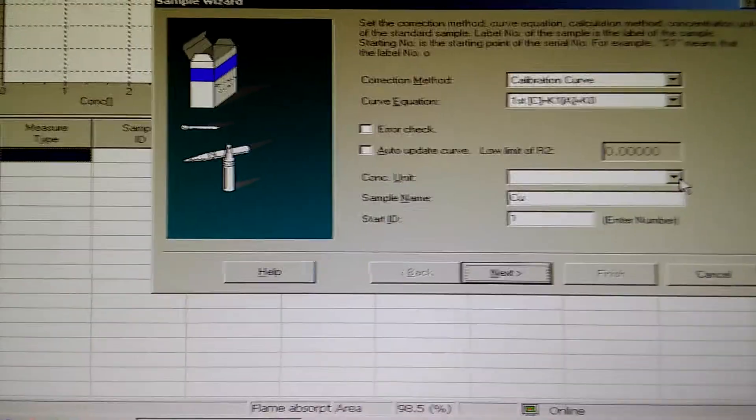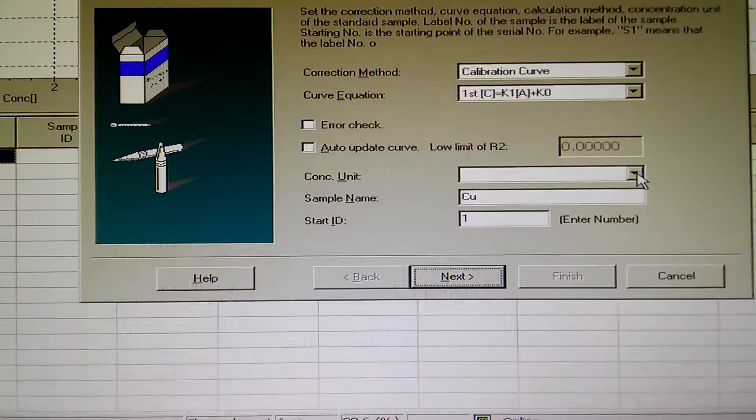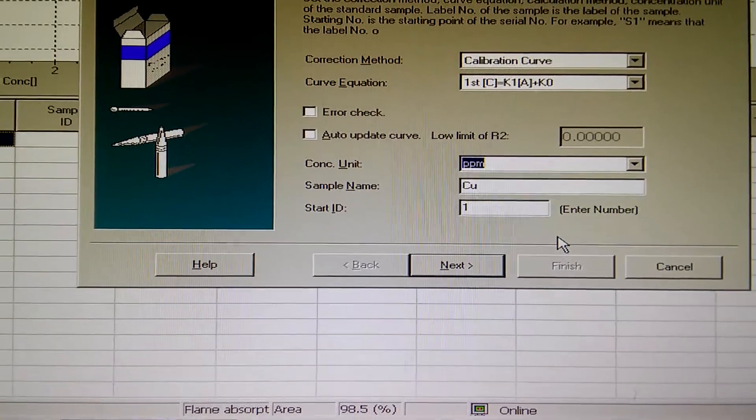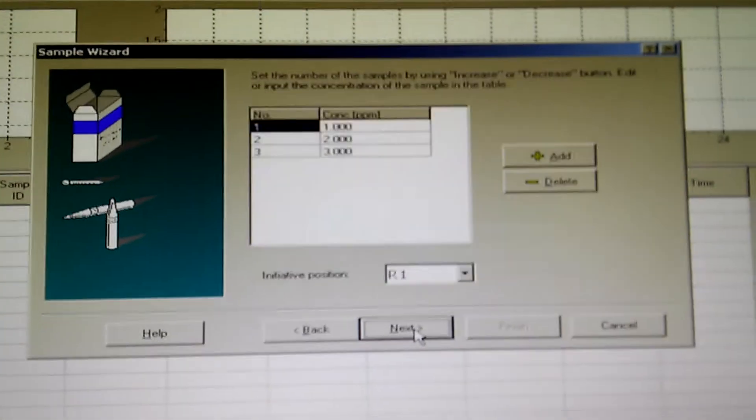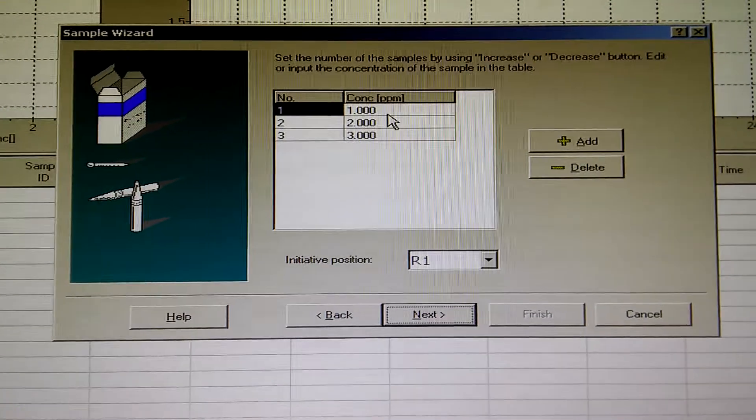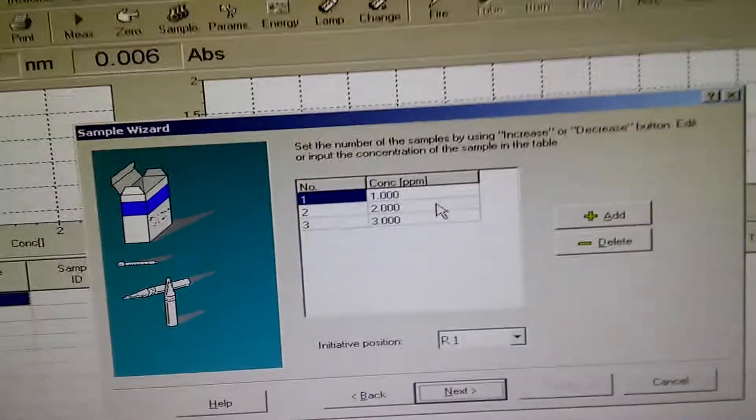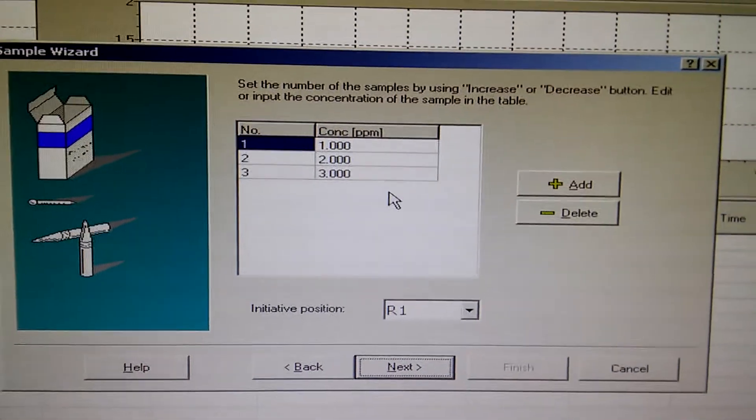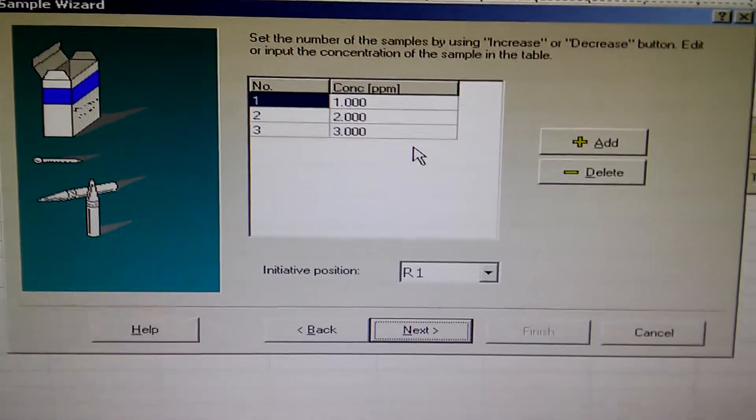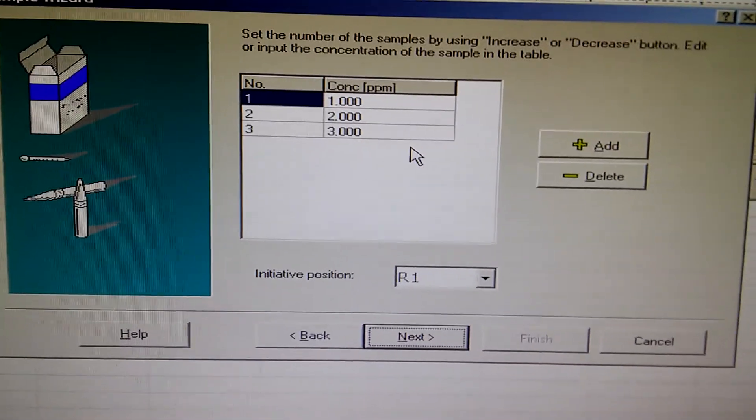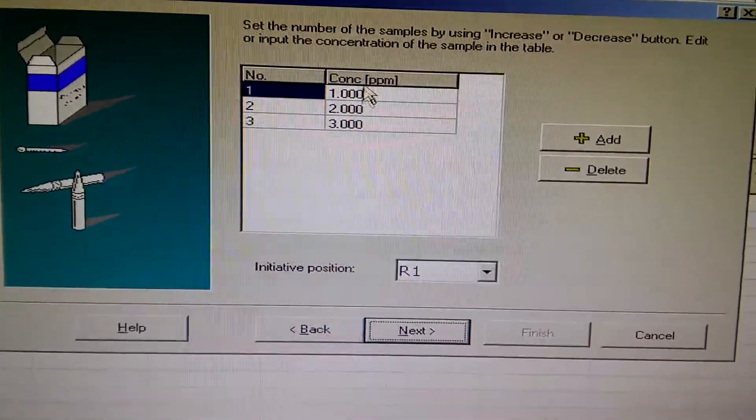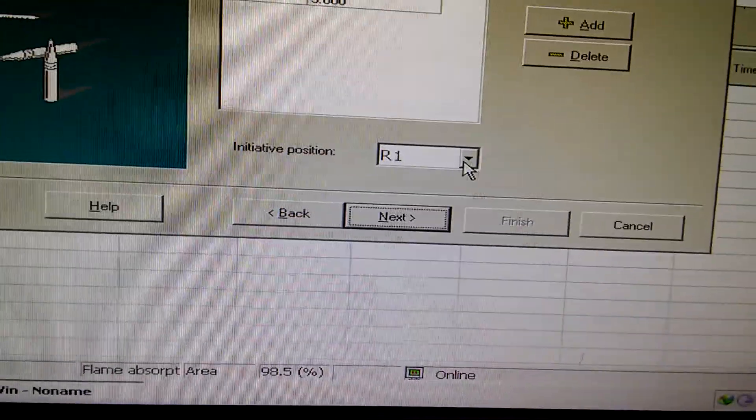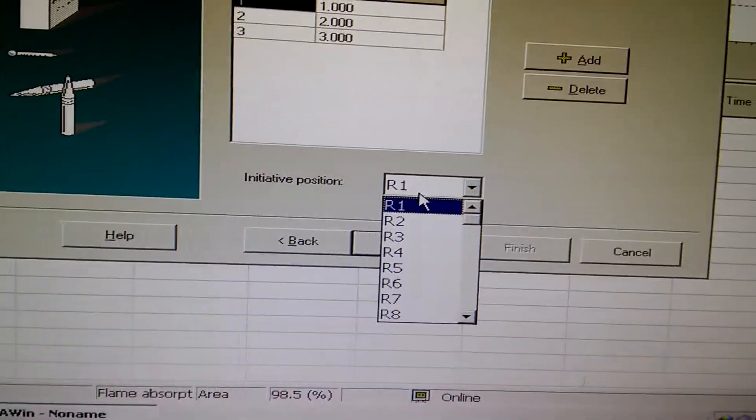These are the settings. Concentration unit, I'm going to use the parts per million, ppm. Press next. Now I have three different concentrations: one, two, and three ppm standard solutions to draw the calibration curve. I put these standards starting with R1.